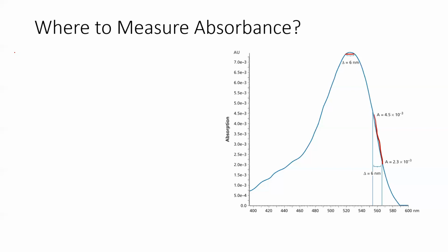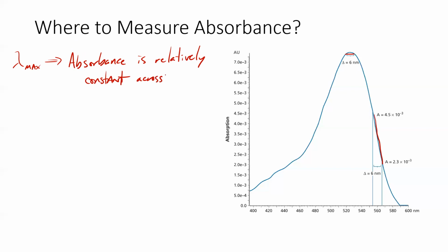And so we choose lambda max because the absorbance is relatively constant across the bandwidth.